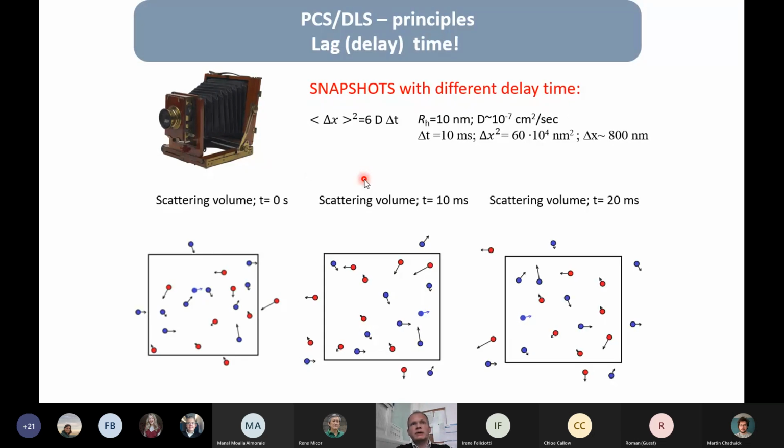Now we will try to make the same experiment, but with a much longer delay time, let's say 10 milliseconds, or speaking about students, let's say 10 hours. Can we predict the number of students, the number of proteins, from the previous snapshot? I guess we can't, because during this delay time between snapshots, there were so many events when some molecules came in, some molecules came out.